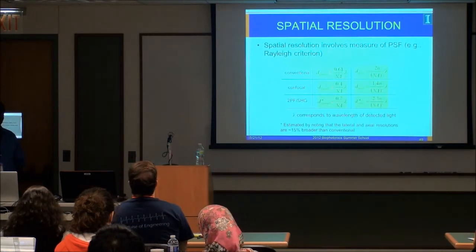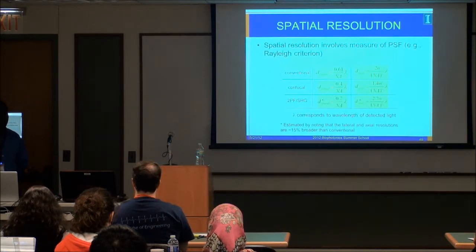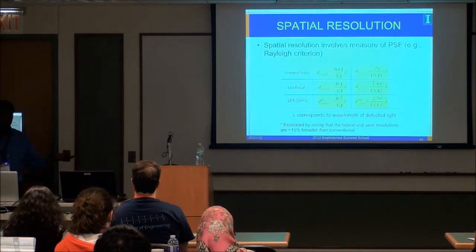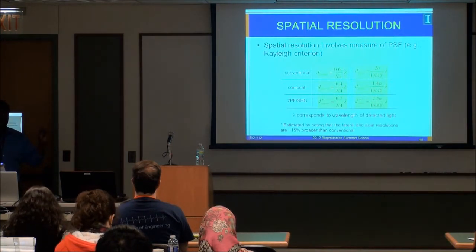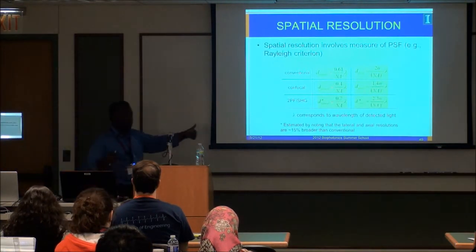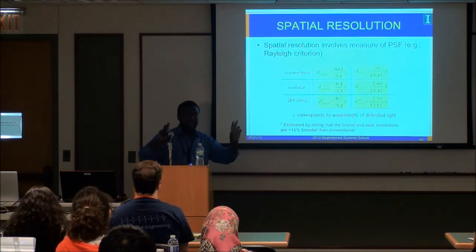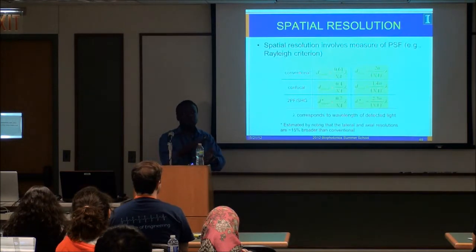And it's obvious as to why when you think about it. Because ultimately what you're still doing is probing with longer wavelengths. And as a general rule of thumb, remember the diffraction limit is related to the wavelength. Shorter wavelength, higher spatial resolution. The power of the technique comes in a much more subtle point. That is, you get deeper. So if one wants to do deep tissue imaging, ideally non-invasive because there is less absorption, then the multi-photon techniques have a benefit. That's one.